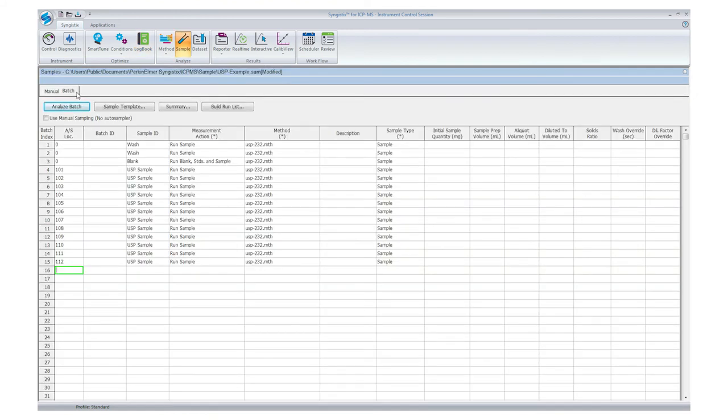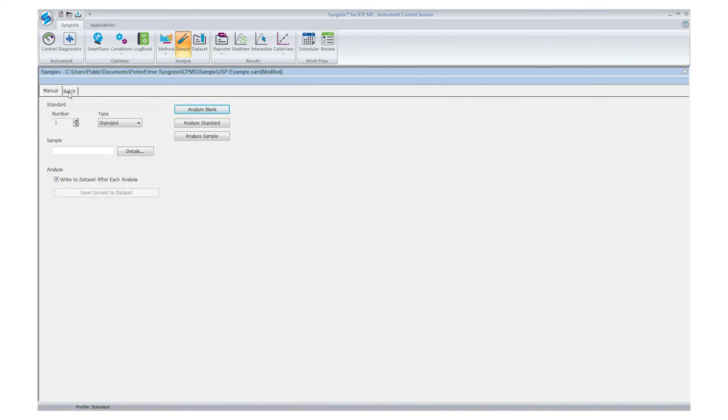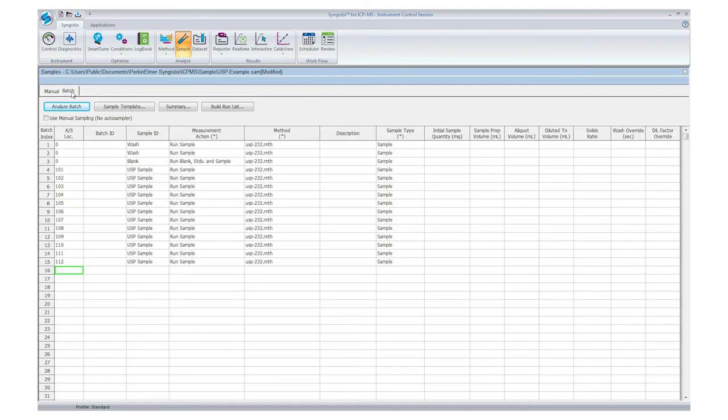Now that the system has passed its performance check, we can proceed with sample analysis. Samples can be analyzed one of two ways, manually or batch-wise. Today, I will demonstrate the batch analysis function.